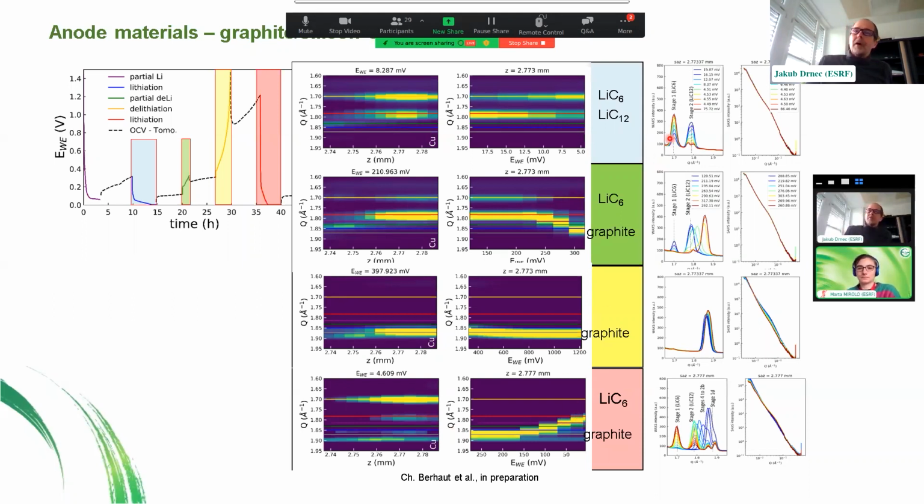What's interesting is that we found that if we combine this with small angle scattering, we can look at the size of the domains of silicon. The silicon has domains in exactly the range which we can measure.